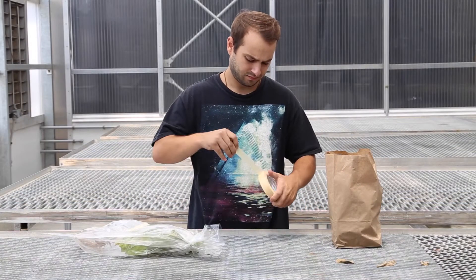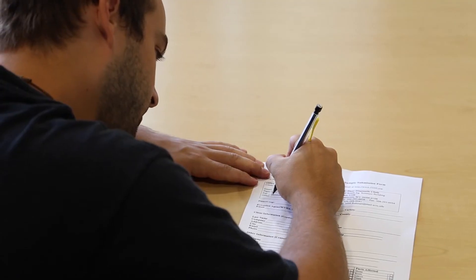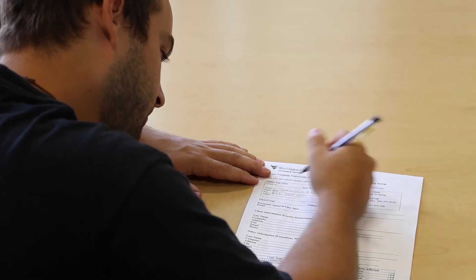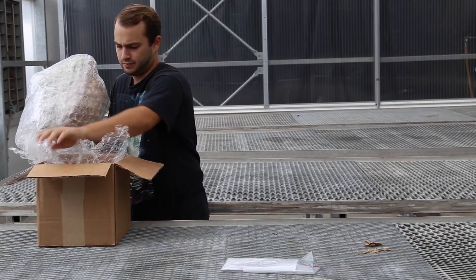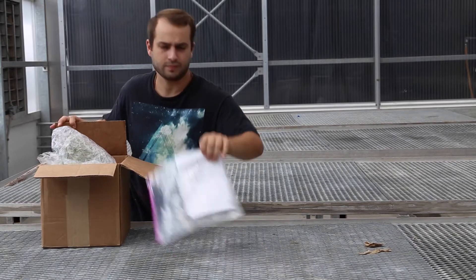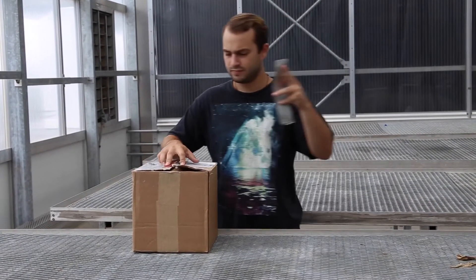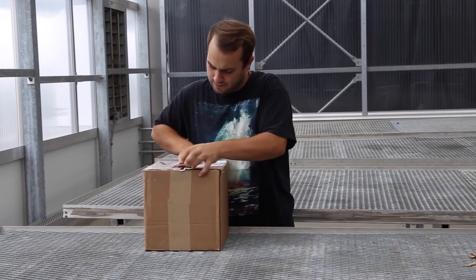If you have multiple samples within a single shipment, be sure that you label each one clearly. Print and fill out the sample submission form. Note that accurate diagnosis and recommendations rely heavily on the completeness of the information you provide. Package all samples in a sturdy box with bubble wrap or newspaper. Place the sample submission form in a plastic bag on top of the samples. The plastic will ensure that the form is not ruined in transit by moisture or soil. Tape the box shut and ship it as soon as possible. To ensure timely delivery, send samples early in the week so that they do not spend the weekend in transit.